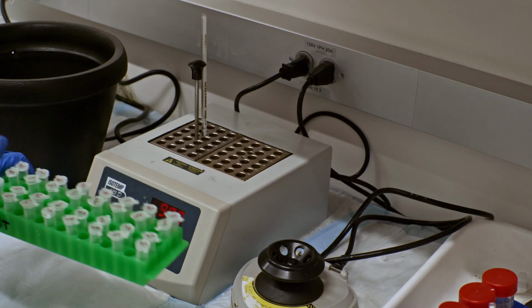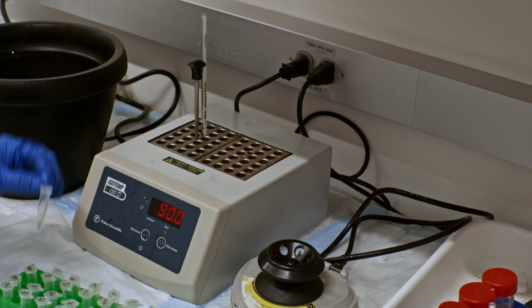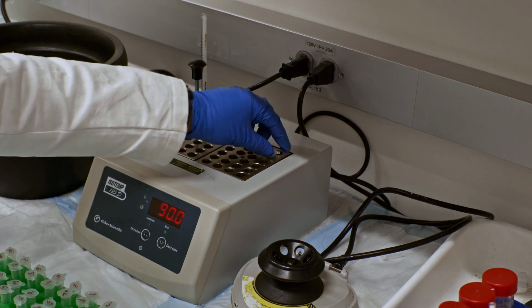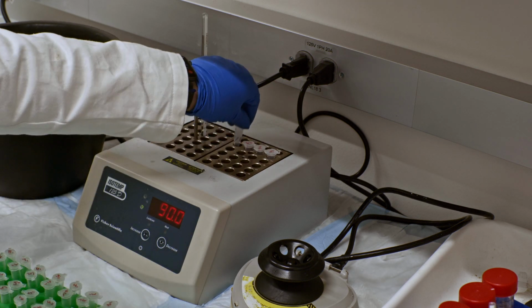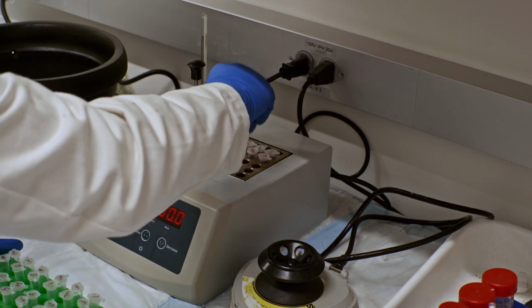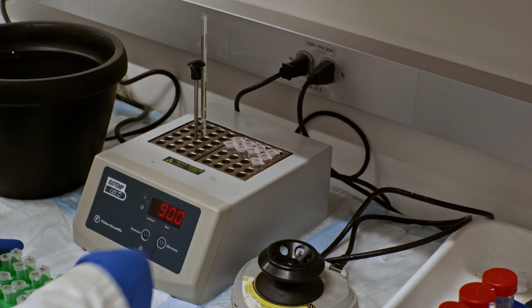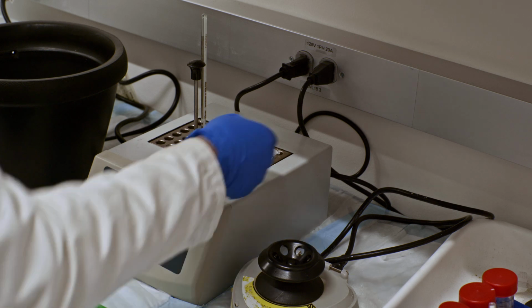So now we are done with the assay, and we've collected our samples here. Next, we're going to heat them up for about 5 minutes. Sometimes with this percent of formamide, they can get a little sticky, especially because you have some protein in there. And by heating it up, it really makes everything a lot easier to just get out of these microcentrifuge tubes, and then also easily put it on your gel. So again, we're going to heat these samples up for about 5 minutes.